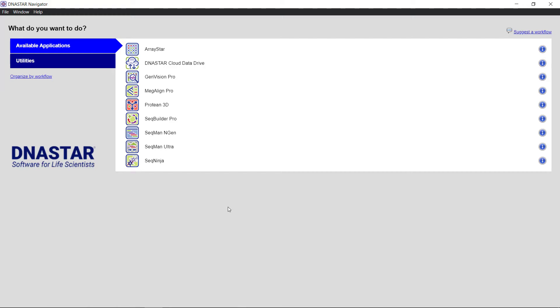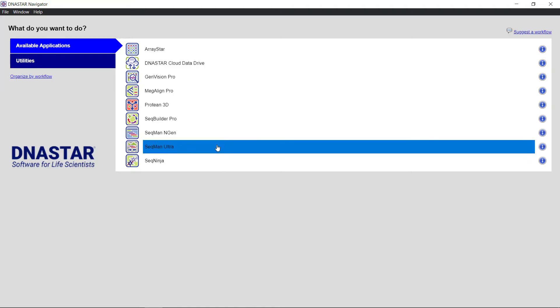In this video, I'm going to perform a templated Sanger Sequence Assembly. From the DNA Star Navigator, I'm going to launch SeekMan Ultra.